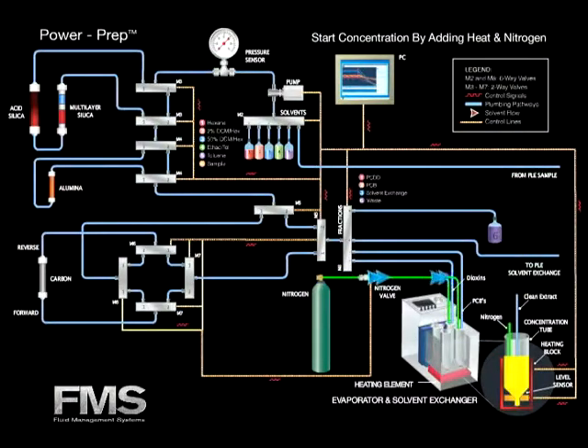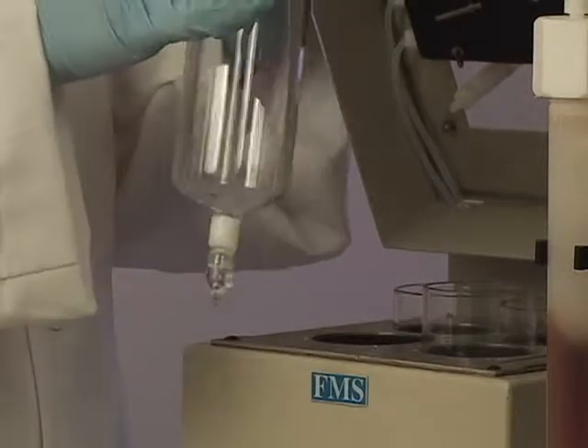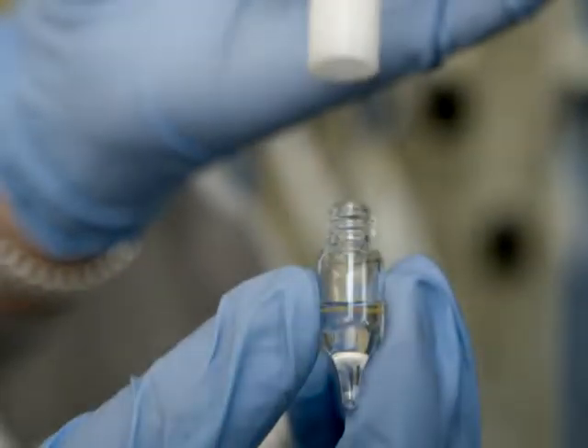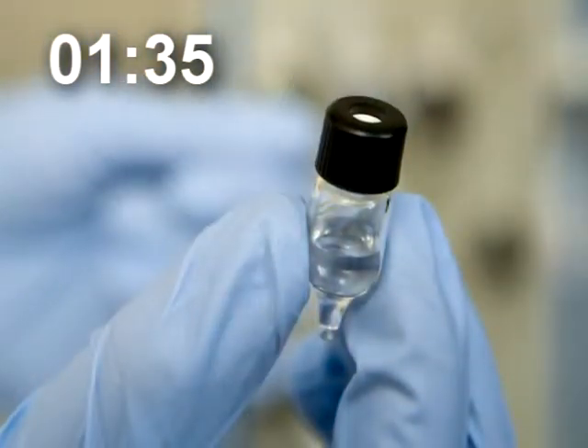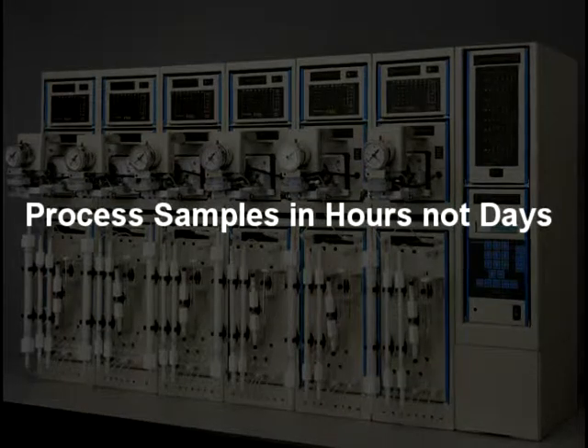The dioxin fraction is collected in the evaporator tube. Then dioxin and PCB fractions are concentrated. The concentration of dioxin and PCB fractions is now complete. The GC vial is taken off of the evaporator tube. The sample is then transferred to the GC-MS for analysis. With the PowerPrep, you can process samples in hours, not days.